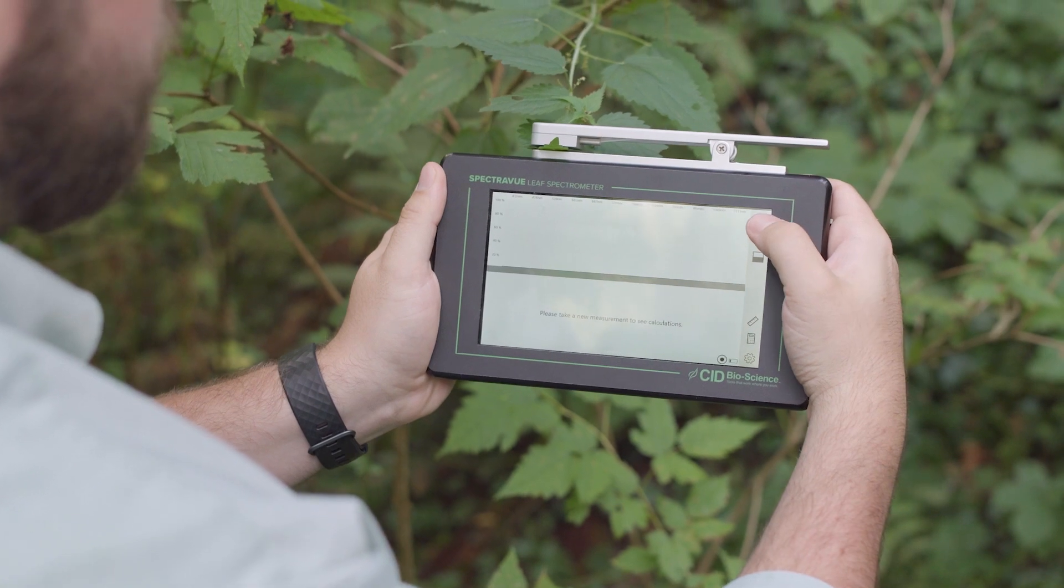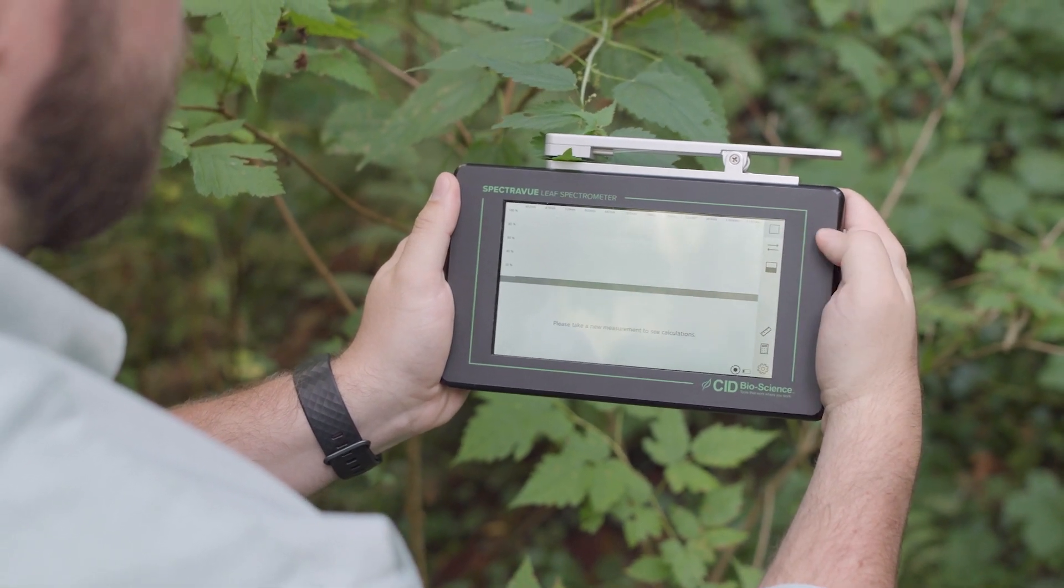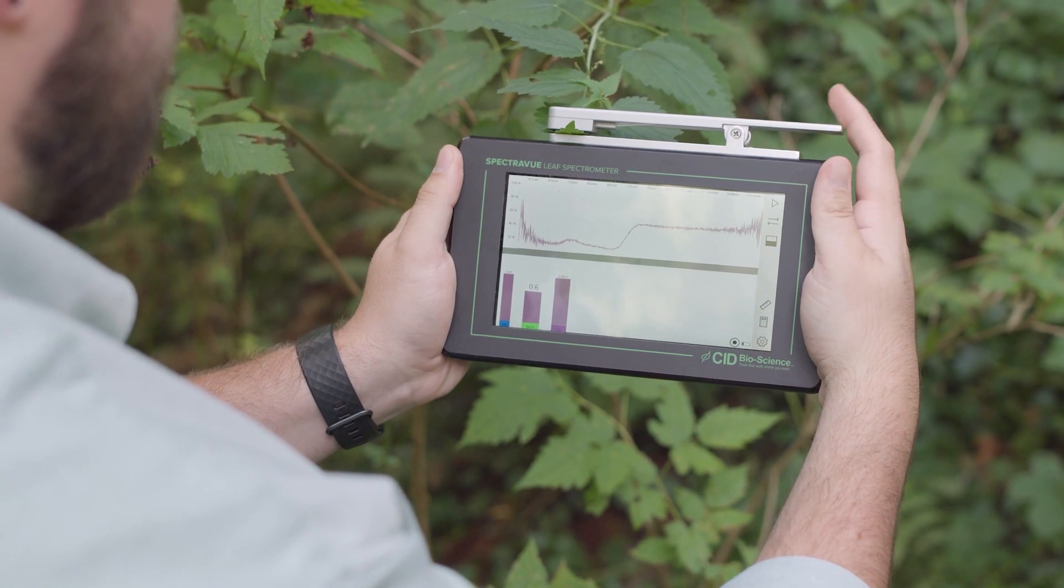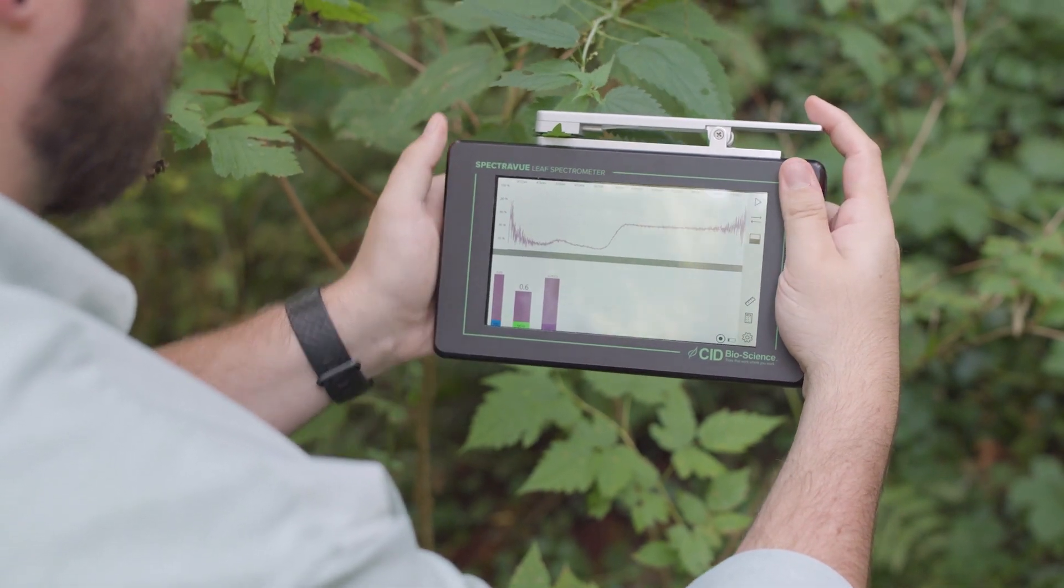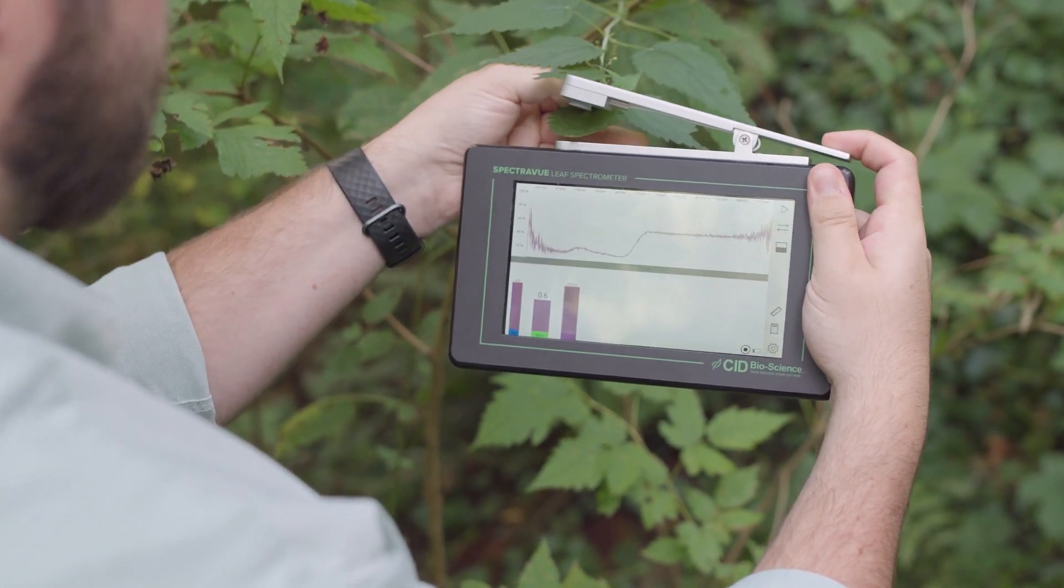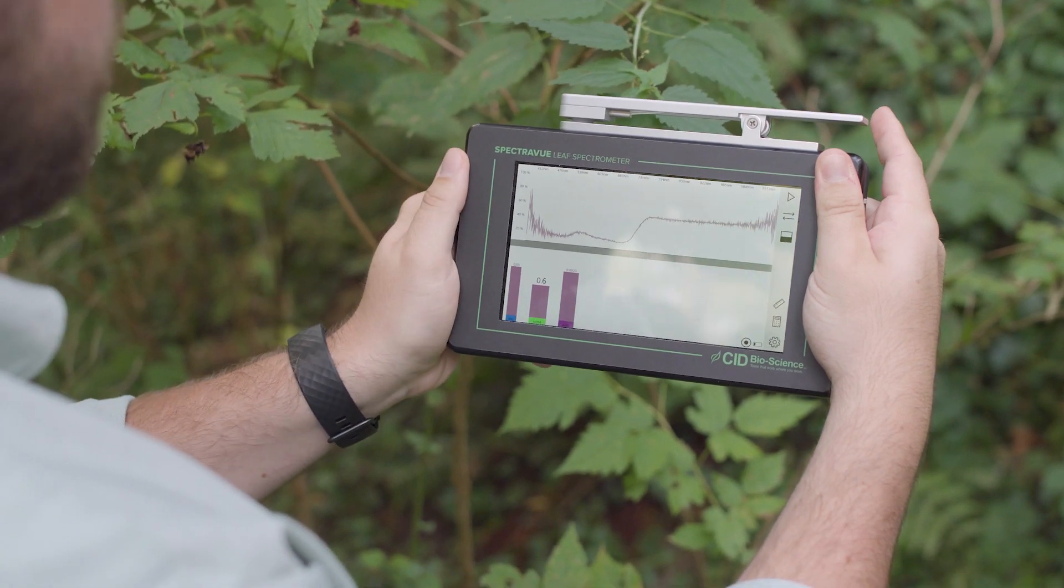So we're going to press the scan button, which is a play symbol. Now the scan is done after one second. I can remove the leaf by unclamping it. That was a healthy leaf.